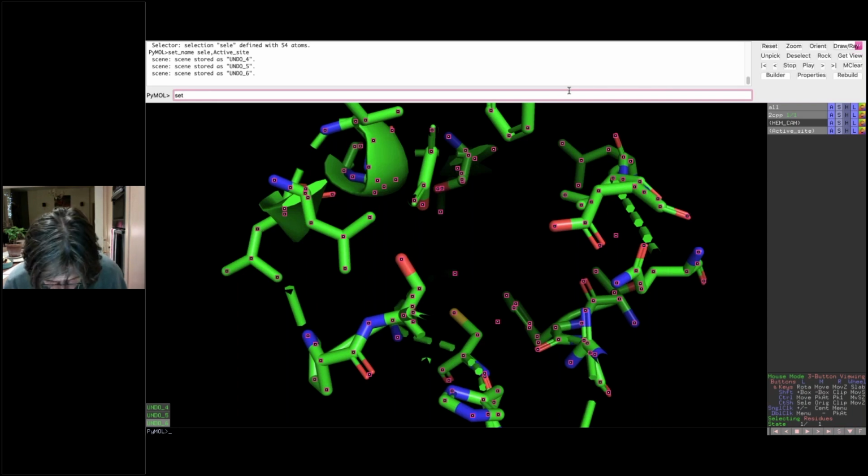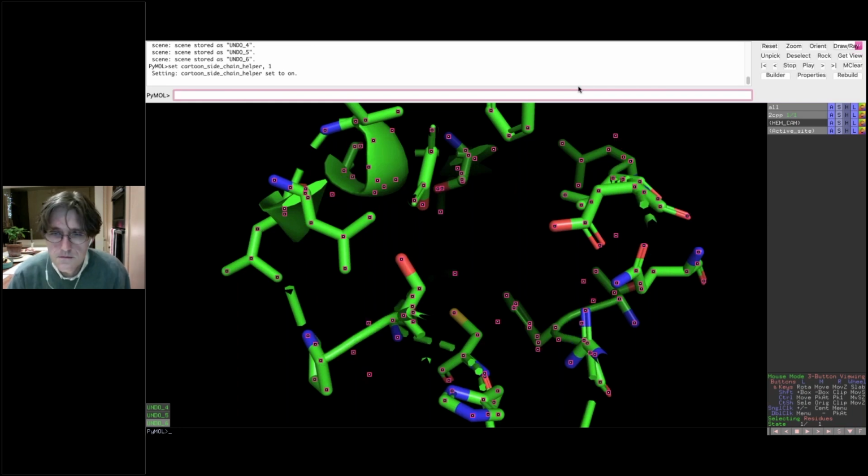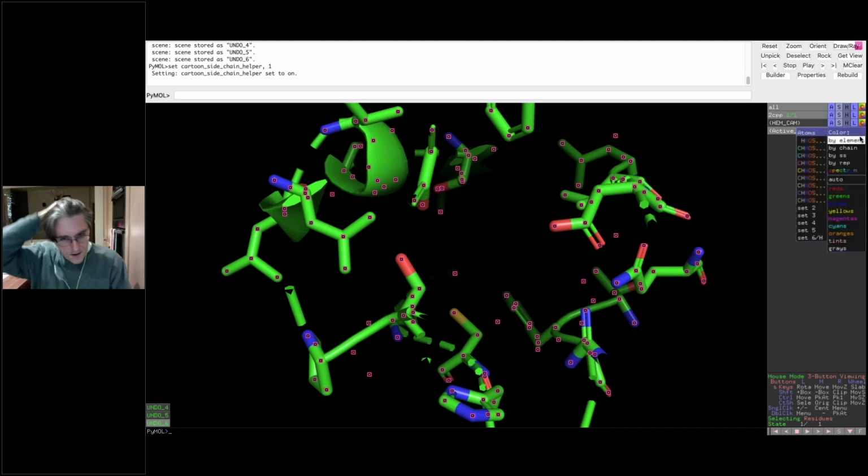Make sure I get this right. So one piece of advice is to try and minimize the visual noise.